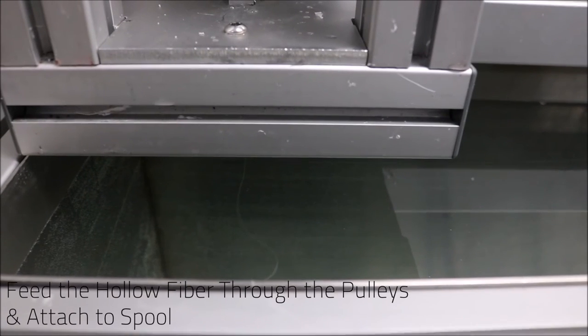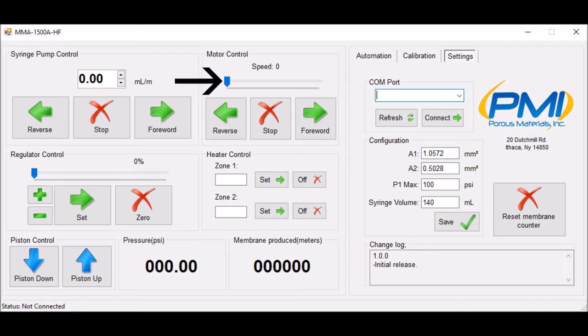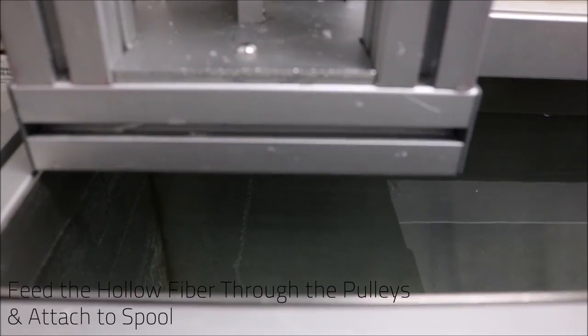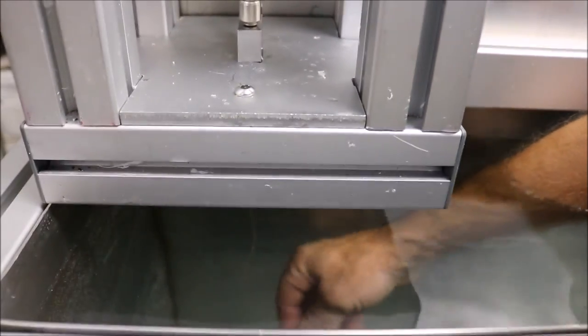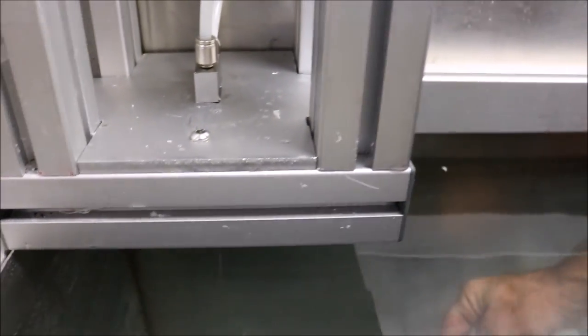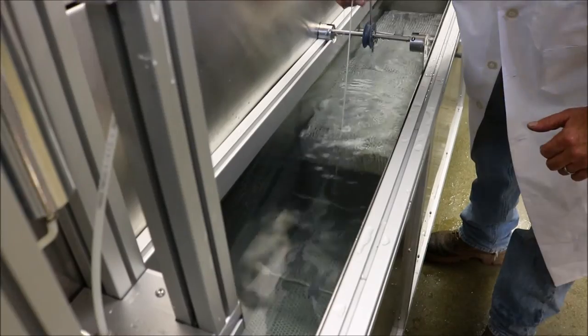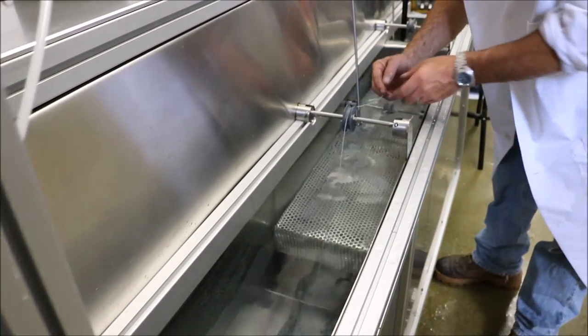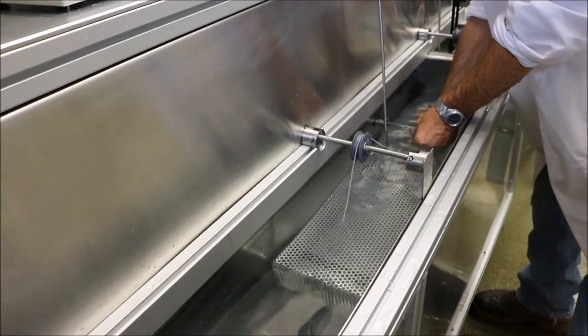After you begin to see the hollow fiber strand forming, initiate the motor for the spool using the motor control in the software. Next, we are going to carefully feed the hollow fiber strand up through the pulleys and connect it to the spool at the end. Be sure to allow enough slack to form so that the hollow fiber strand is easily manipulated up through the pulleys.